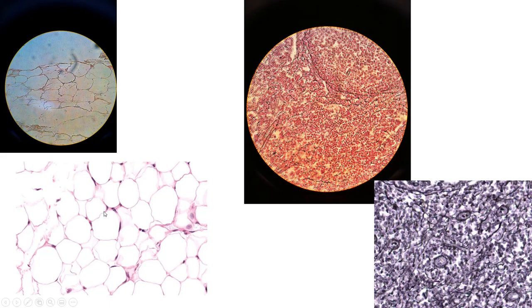Over here we have adipose tissue, so this is fat tissue with the adipocytes and the triglycerides stored in here. This is reticular tissue, so dark stringy fibers found primarily in lymphatic organs, helping form the supporting framework called the stroma, such as the spleen.